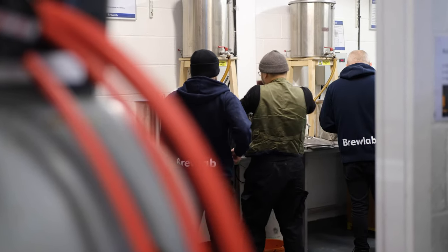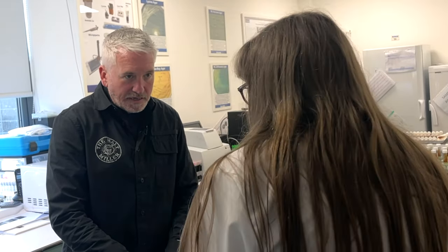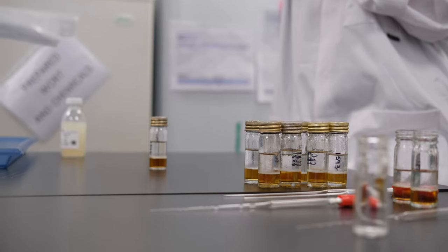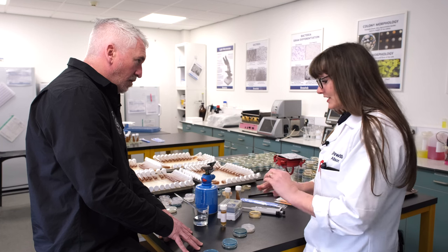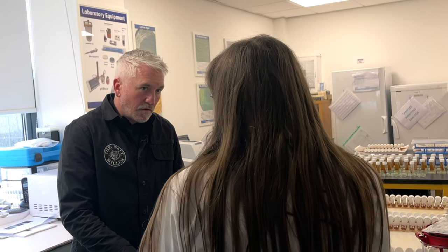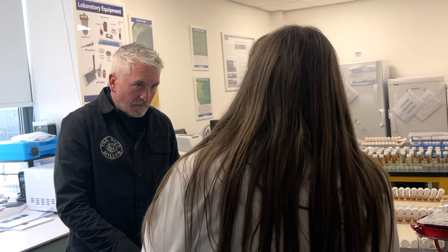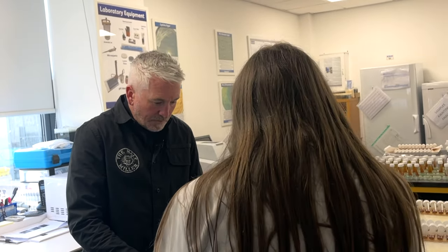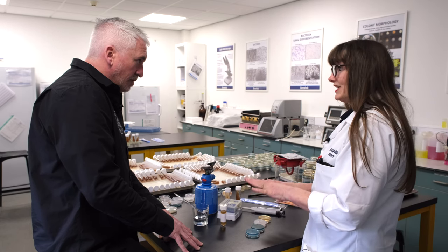So relating this back to the home brew world - how would we test a sample of finished beer or yeast we want to reuse? First, you want a representative sample in a sterile container - you can sterilise them yourself. We're going to spread a volume of the beer over the surface of the plate. Depending on the sample, you select the appropriate media plates. These four plates are selected for beer samples that have yeast in, because they inhibit brewing yeast from growing, so we can still see contaminants.